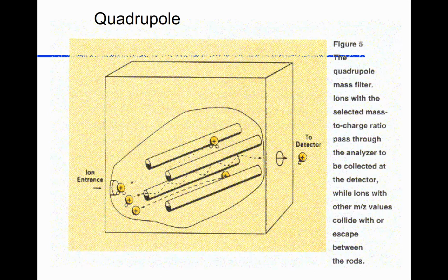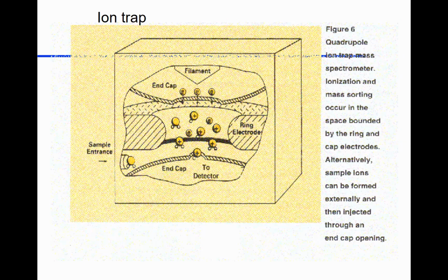That is, like I say, the workhorse. We've got 4 of them down in our laboratory that work on this basis. They're cheap, they're efficient, they work well. They're not high resolution. They will tell you it's a mass 78, but they won't tell you it's 6 carbons and this many hydrogens and no oxygen. It just gives you a mass. It doesn't have good resolution of mass.